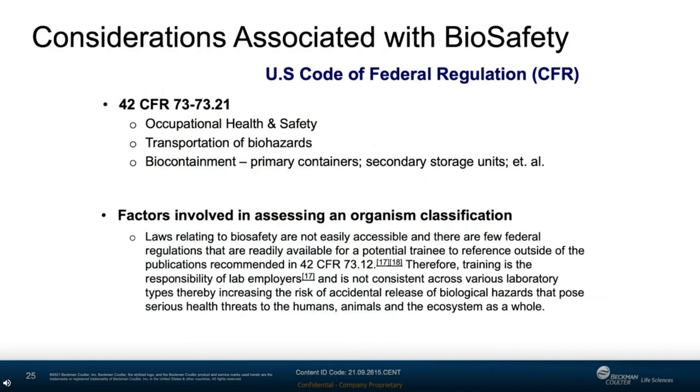The Code of Federal Regulations, CFR, codifies the rules issued by the agencies of the federal government. Section 42 CFR 73 relates to the possession and use of various viruses, including SARS-CoV, where registrants must develop and implement a written biosafety plan to be reviewed annually, describing the biosafety and containment procedures. Part 73.12 calls in part specifically for, quote, centrifuge safety containers, unquote, to protect lab personnel and the public.